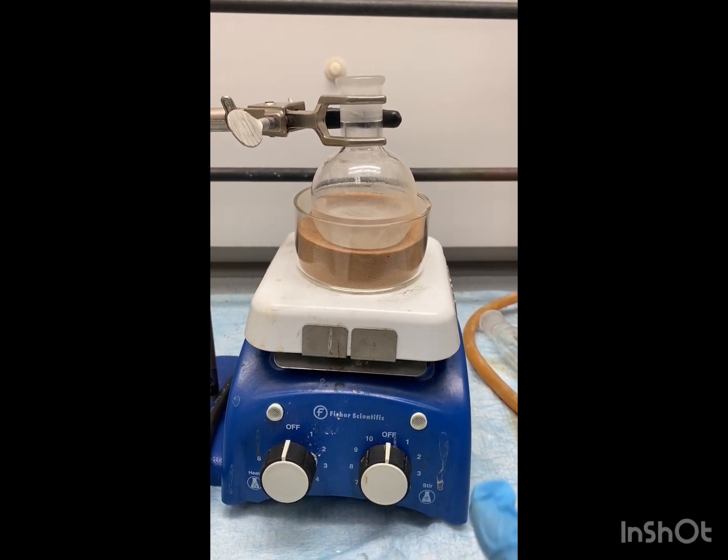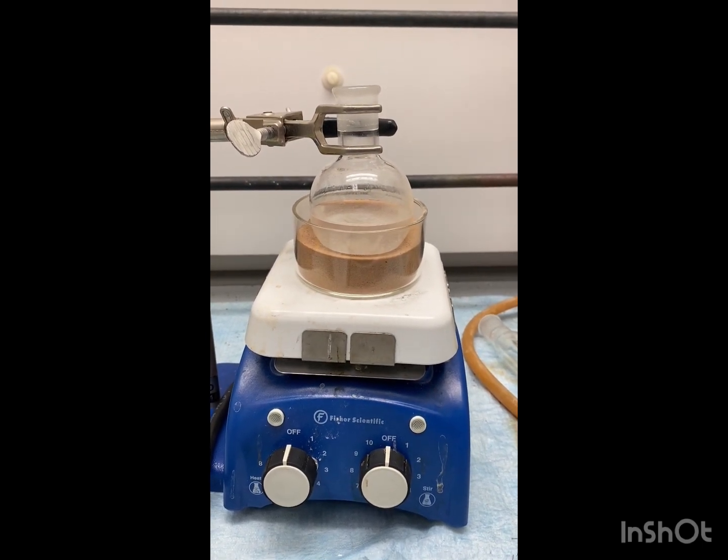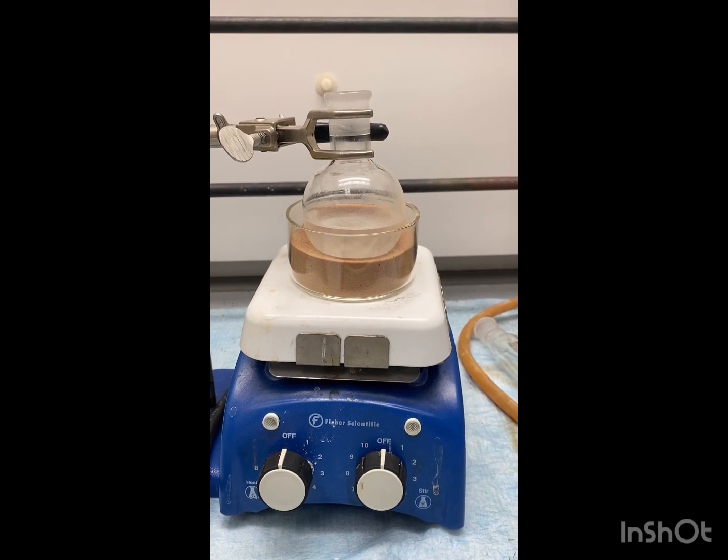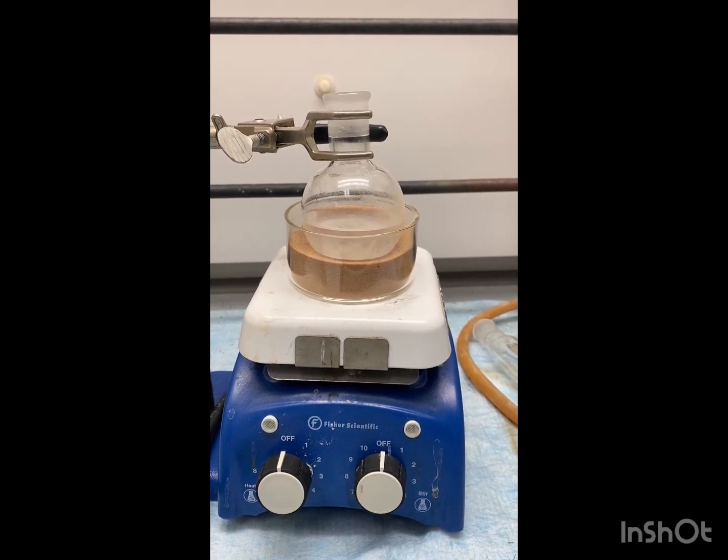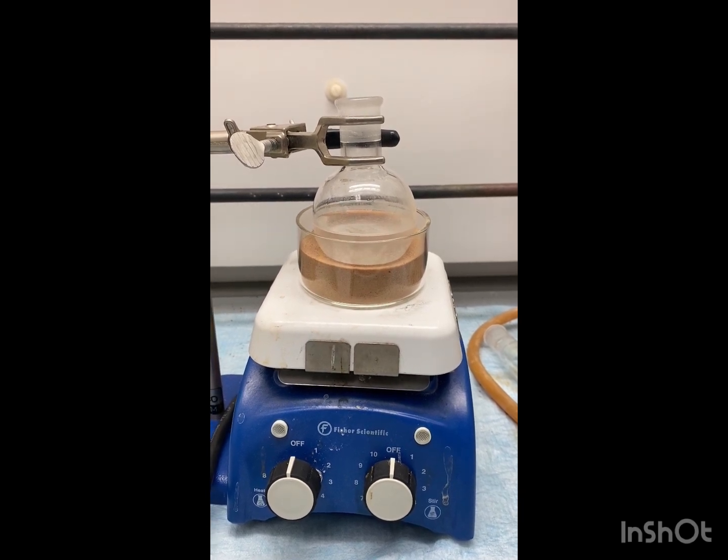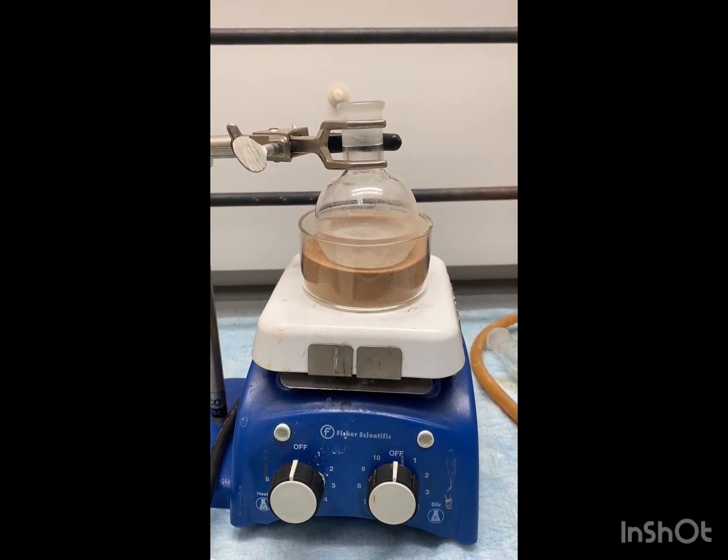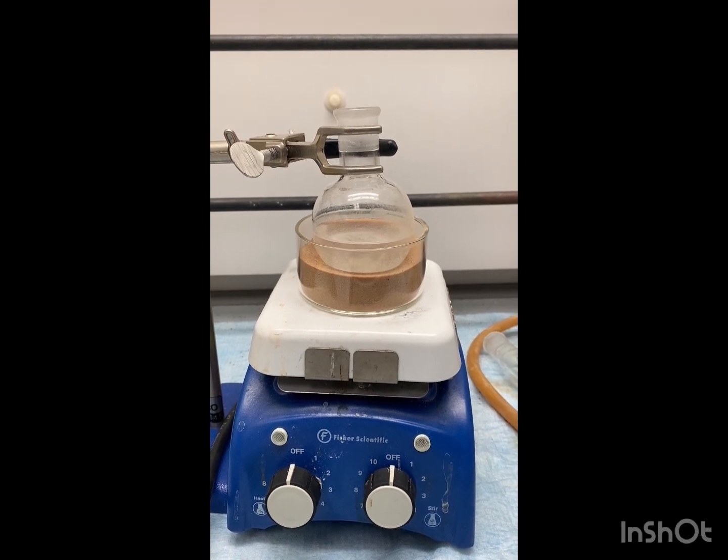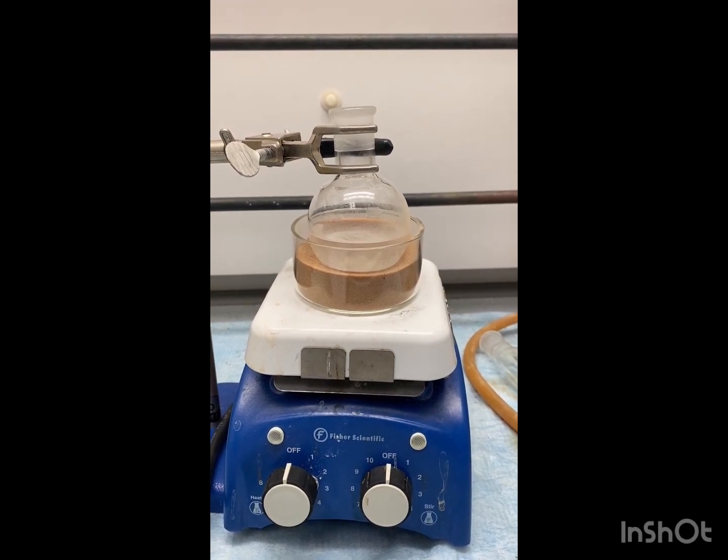We have a sand bath here on top of our hot plate. We are then going to put a condenser, and we're just going to gently reflux the mixture. We're also going to add a thermometer to the sand bath. You don't want it to reach over 200 degrees Celsius, so just monitor it. You're going to do this for about 15 minutes.